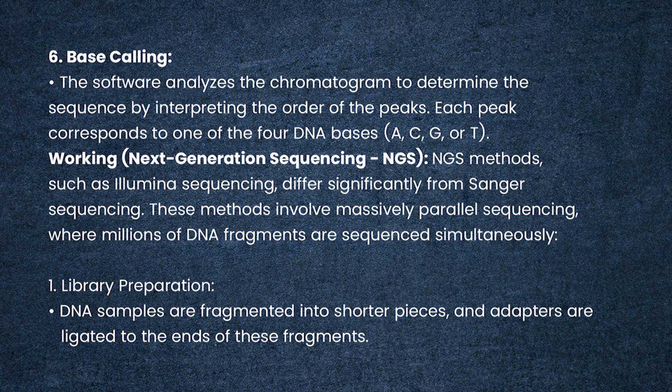Talking about the working of next generation sequencing or NGS. NGS methods such as Illumina sequencing differ significantly from Sanger sequencing. These methods involve massively parallel sequencing, where millions of DNA fragments are sequenced simultaneously.